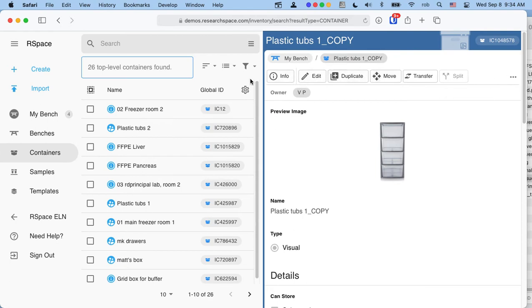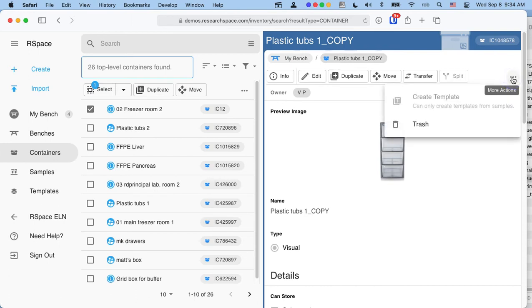There are all sorts of great technologies coming for future releases of the product. Just like in the main navigational tree, if you select an item and you want to see additional actions that may be available to you, you can click the 3 dots here to see different actions, and you can do the same over here on the card to see actions that might not necessarily fit in the top row. One of the actions you'll often see here is the ability to move this particular item to the trash. Items that are moved to the trash will sit there pretty much forever currently, and you can examine items in the trash to find them and retrieve them if you need to. So if you trash things, you won't be losing data about containers or samples because you can still access those samples in the trash area.